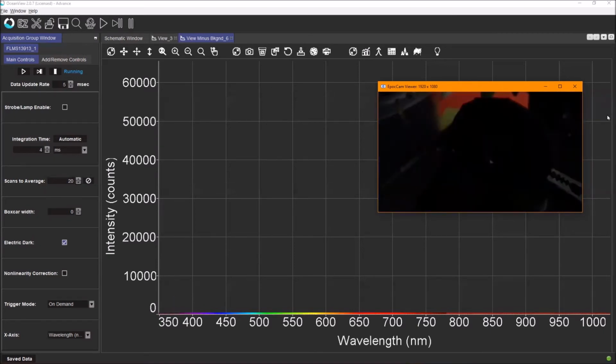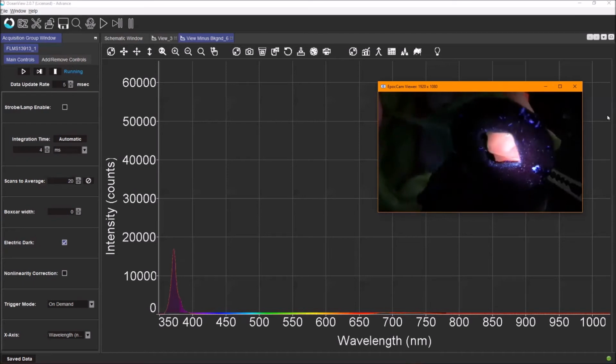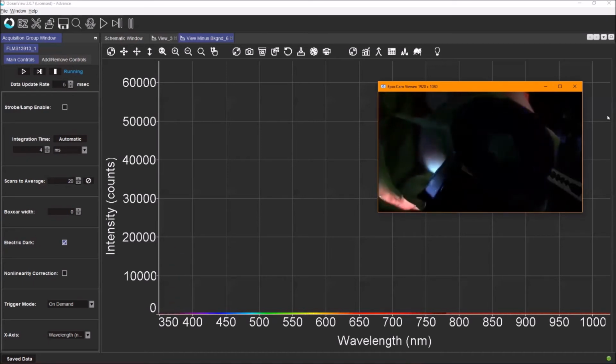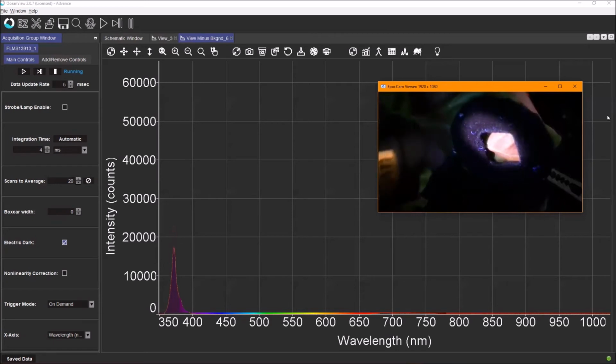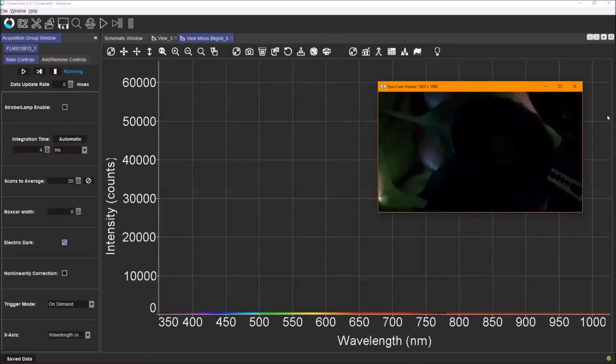Spectacular. Now, chlorophyll fluoresces in red when exposed to UV light. So here I have a basil leaf, and if I expose it to UV light, it turns red. You can kind of see the fluorescence around 675 nanometers. There's a little bump that appears at the bottom. If I turn off the light, it's just a green leaf.